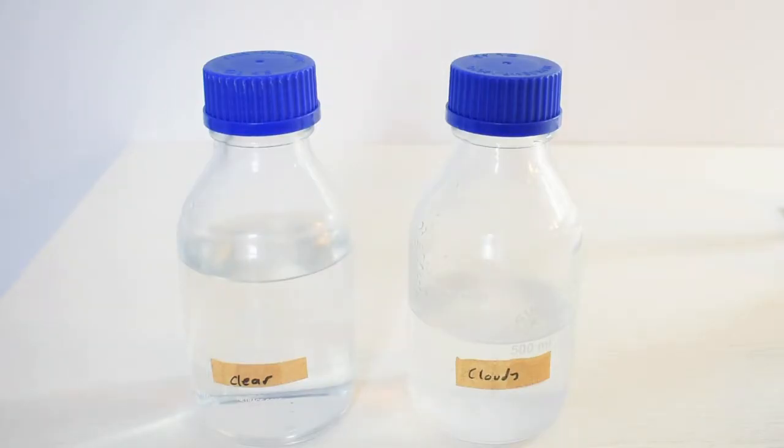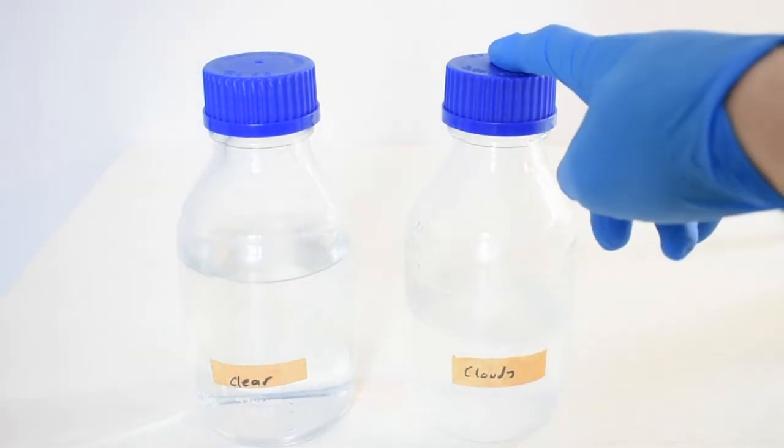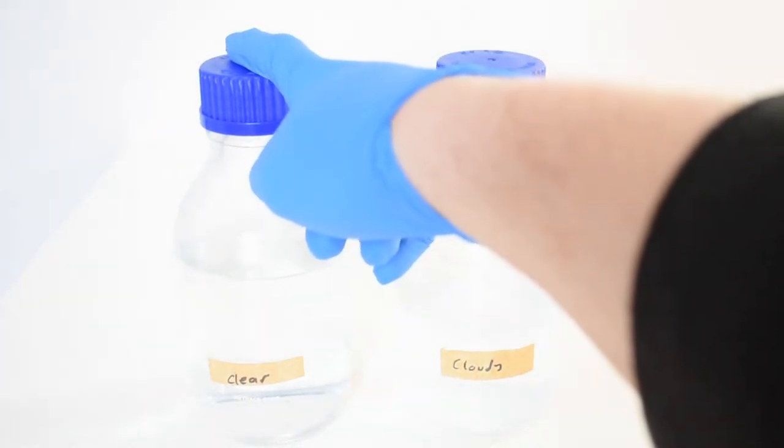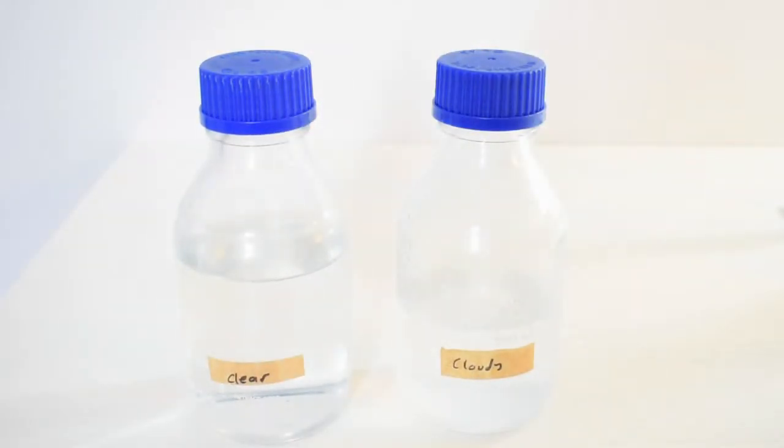At this point, I have two bottles of distillate. This one is the cloudy distillate which came over first in each of the runs, and this one is the second clearer distillate which has less oil.